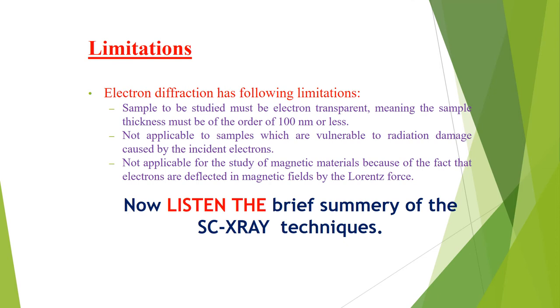Generally used X-ray sources in X-ray diffraction technique, and depending on the type of sample, three techniques are used in XRD laboratories. One is powder XRD analysis, second is thin film XRD analysis, and third is single crystal XRD analysis. In powder XRD analysis, many small crystallites are randomly oriented, and the diffraction condition is met at spheres in 3D reciprocal space, isotropic. It measures in one direction, or point or strip detectors are used.